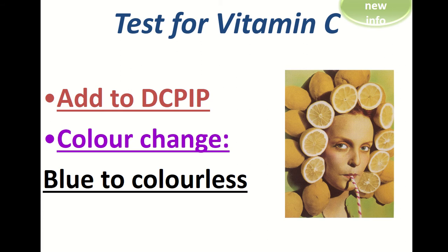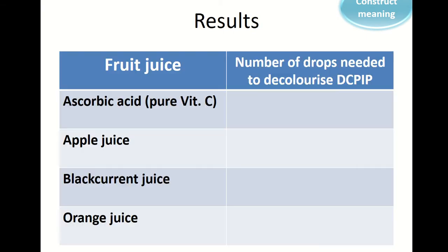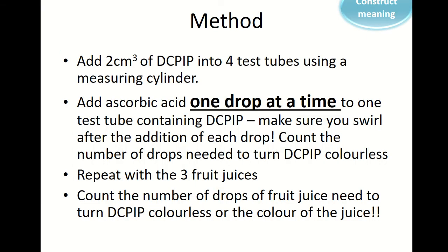So our method is to add two centimeters cubed of this DCPIP into four different test tubes. We're going to add ascorbic acid one drop at a time, which is pure vitamin C, and we will swirl it after each drop.